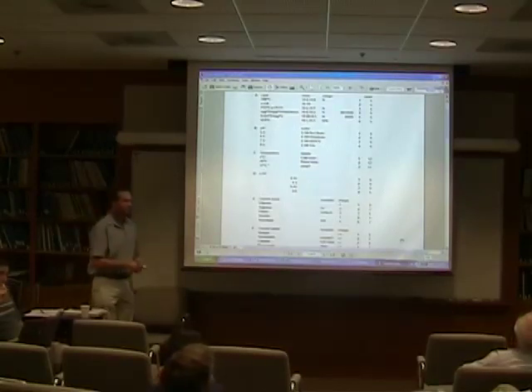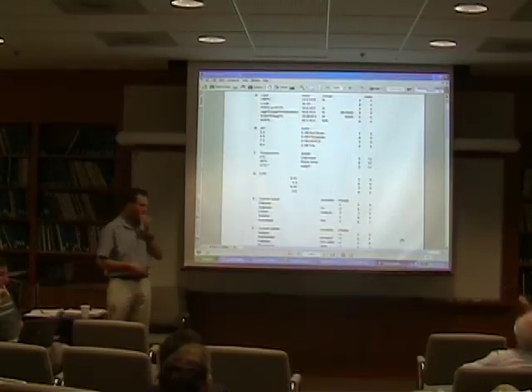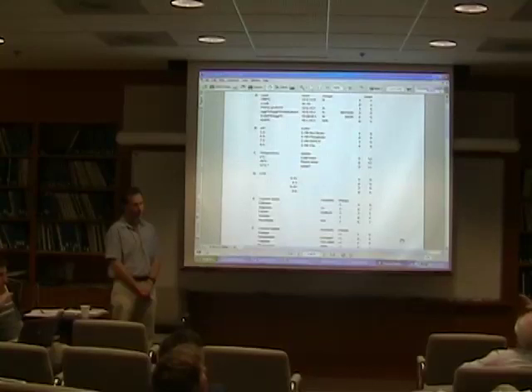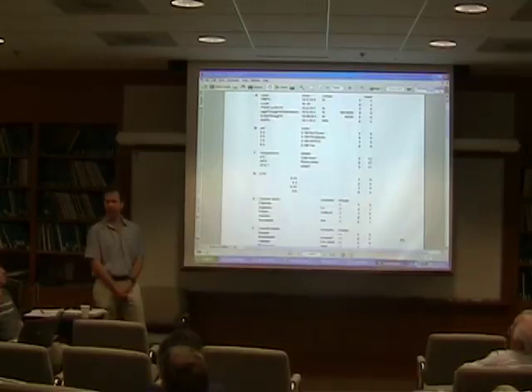Any other, sorry, it's quite a different direction, but I think this must be some kind of multidimensional optimization problem, a very complicated landscape. So I think we could also think of a more mathematical way to approach the problem, and maybe talk to mathematicians about what they think would be a good strategy to find the optimum conditions. If you are close to an optimal point, there could be a gradient, to go along this gradient as well. So certainly a kind of mathematical process could be useful. Does anybody have any other ideas about ways of screening this in a more appropriate way?